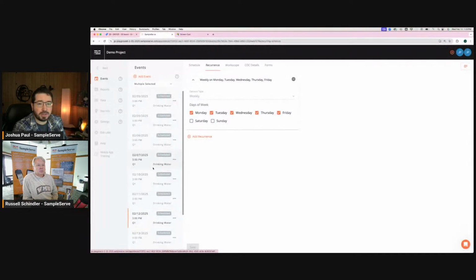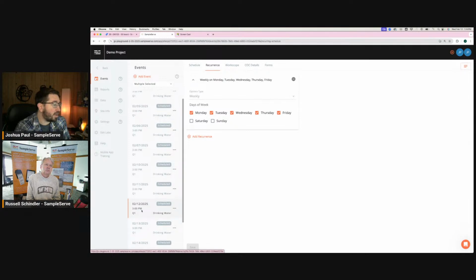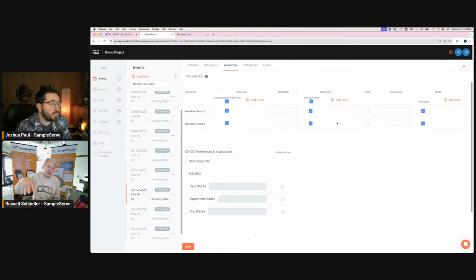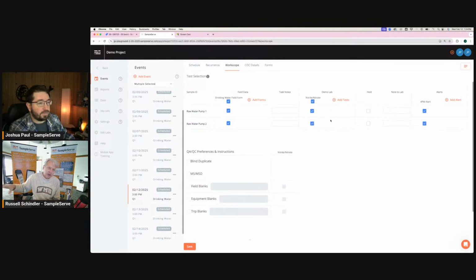Now, they're still scheduled because obviously I wasn't going to go out and take fake samples throughout the week just for the heck of it. But all these sample events have just been automatically generated. I didn't create these. These just showed up here. You can see they're dated 2/5, 2/6, 2/7, and then it skips the weekend for Monday, Tuesday, and then there's one here on the 12th for today. So this is the one that we're going to be sampling today. And then it only goes 3 days in advance, so it's not going to do the entire year. It just stays out there 3 days in advance.